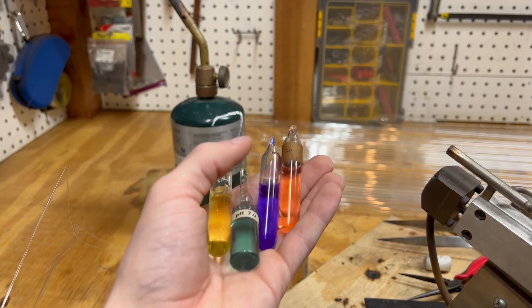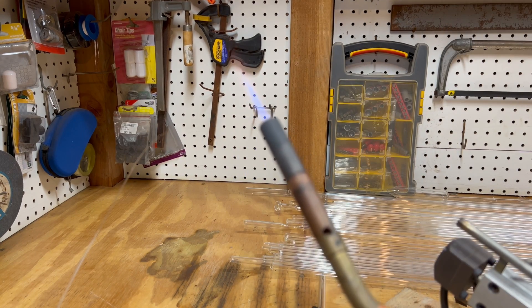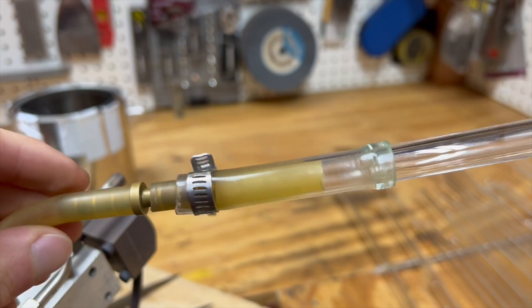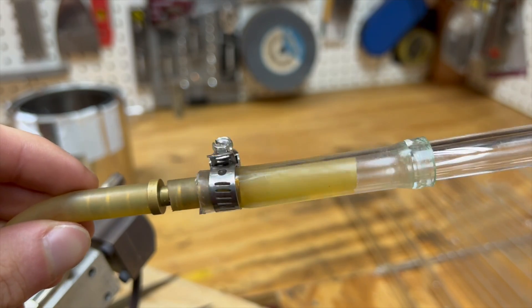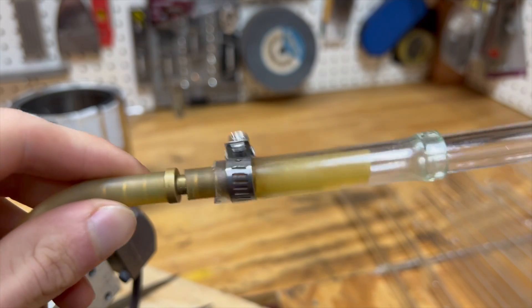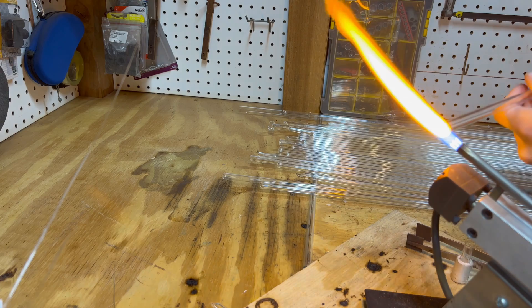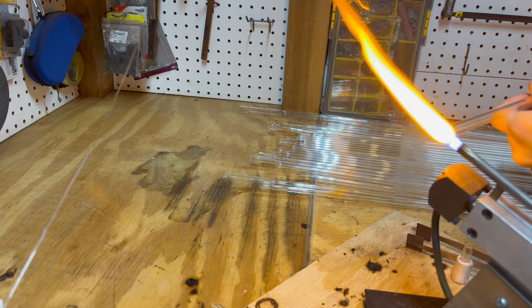Everything I do in this video can be done with basic tools from your local hardware store, or without. The torch can be switched for a MapPro torch, the glass tongs for regular pliers, and the blowhose assembly can be done without. Just make sure that the ends of the tubes you're blowing into have been flame polished to avoid cuts. This will make it more difficult, and more care will be needed to make sure the end of the tube is nice and round. The blowhose tube assembly is a tube that spins and allows air to be blown into the spinning tube. It makes projects a lot easier to see what you're doing, and if you stay making glass for long, you're going to end up needing one for larger projects.